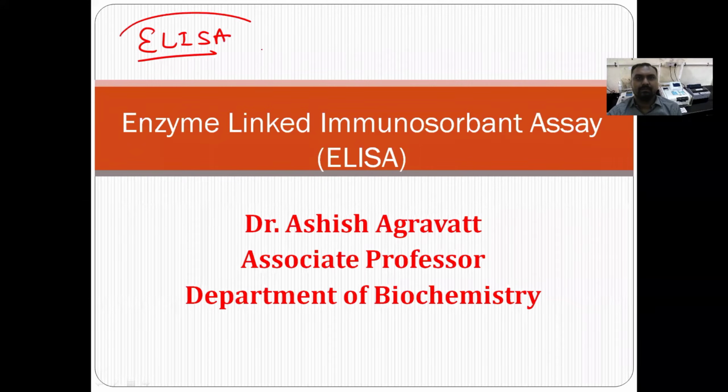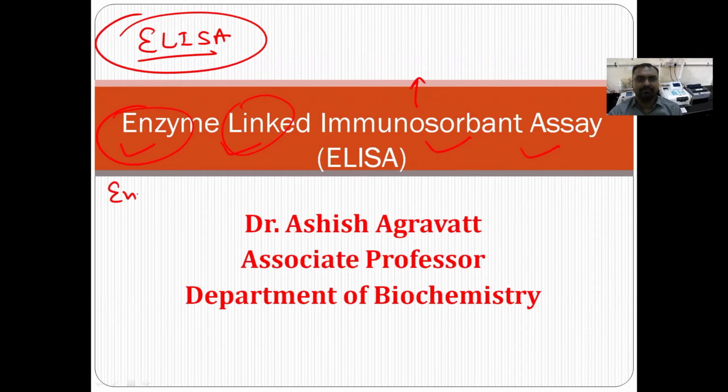Today I am going to discuss the ELISA technique. The full form of ELISA is enzyme linked immunosorbent assay. Here either the antigen or the antibody is labeled with the enzyme. That's why it is called enzyme linked.